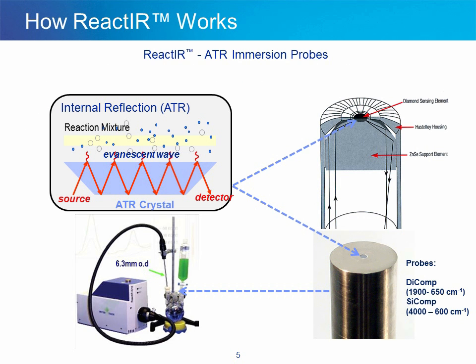In an academic setting, I think we are all most familiar with use of infrared spectroscopy as a qualitative tool for characterization of organic compounds, and using sodium chloride plates, which means that we can't do anything in water. However, infrared spectroscopy doesn't have to be that way. If we have an ATR immersion probe, an attenuated total reflectance probe, infrared spectroscopy can be used as a quantitative tool and a robust tool that can be pretty much put into any type of chemical reaction.